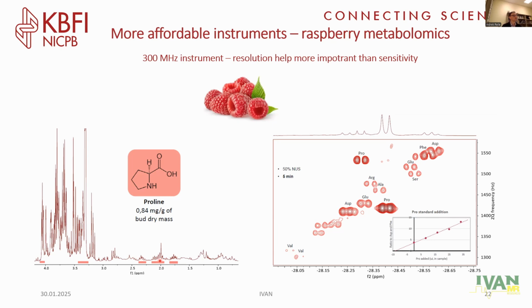So not really feasible. So we applied this NH-PHIP methodology to this raspberry juice, and it turns out that we can resolve all the amino acids that they cared about by hyperpolarized NMR in a 5-minute 2D experiment. And over here, I think this is another point: we are not using hyperpolarization to necessarily boost sensitivity. I mean, we have plenty of sensitivity here, but we are harnessing NH-PHIP's property of placing the signals of interest somewhere else.